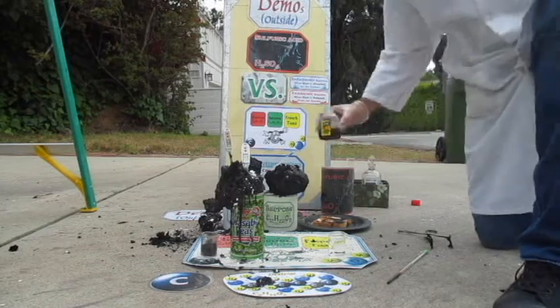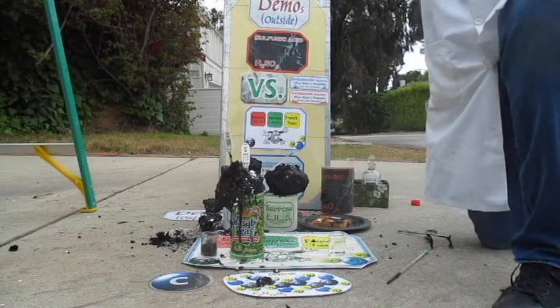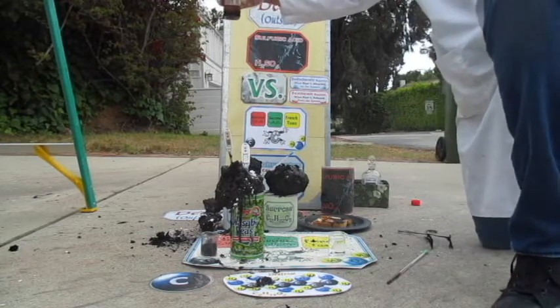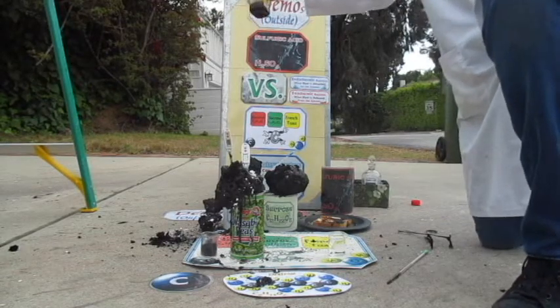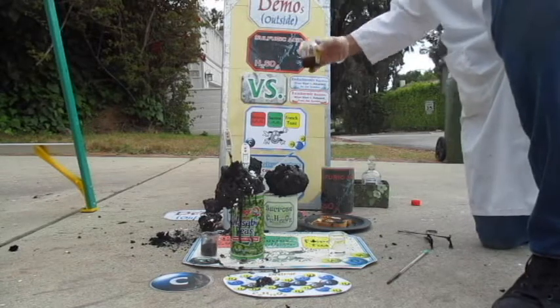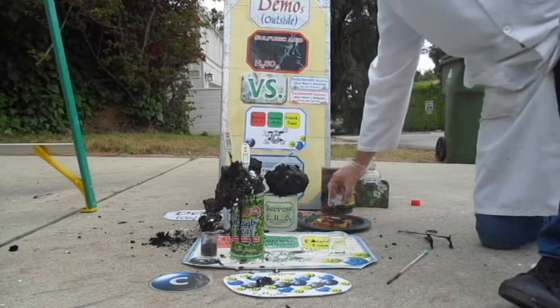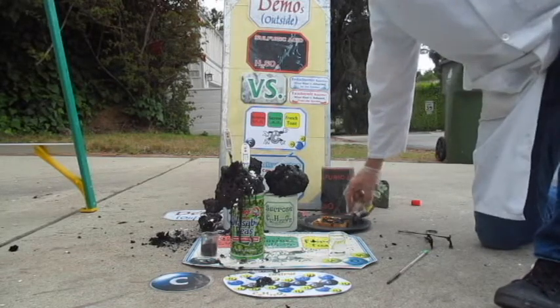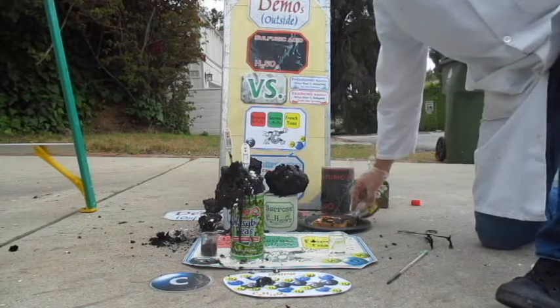And the honey, sadly, is just turning black. I don't think we're going to see any dramatic reaction. You probably don't want to use this honey anymore. This is not a good syrup to put on your French toast. Not a good one anymore. I don't think it'll react if I pour it out like that.